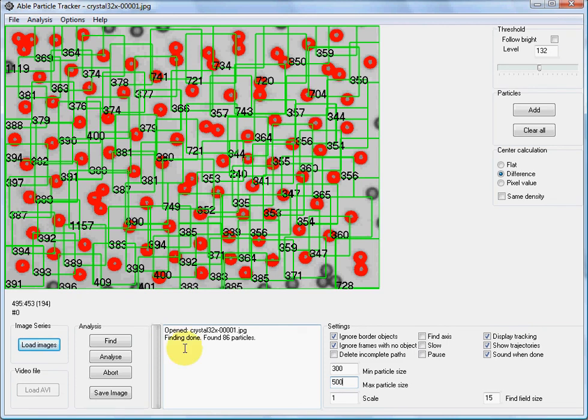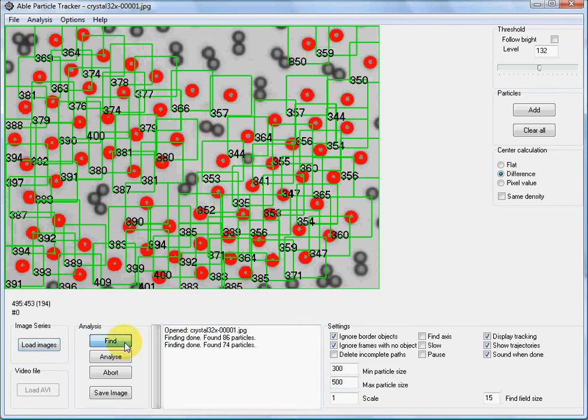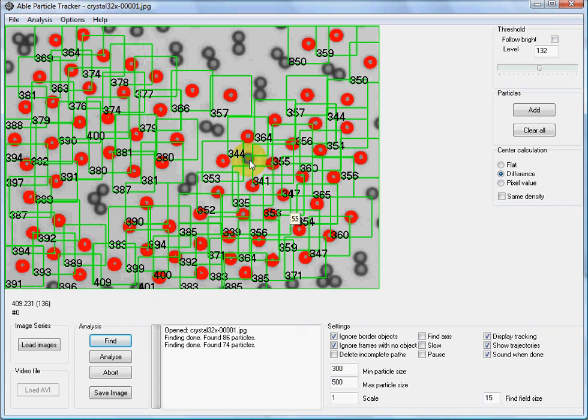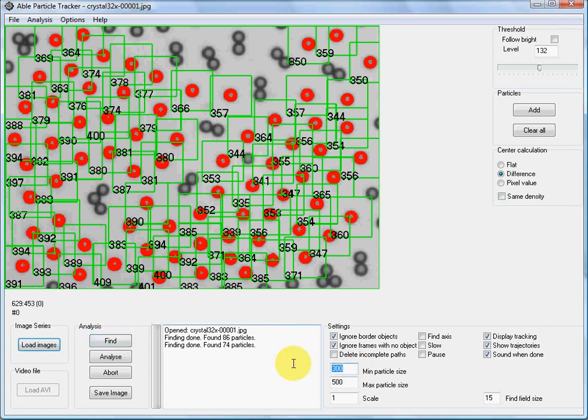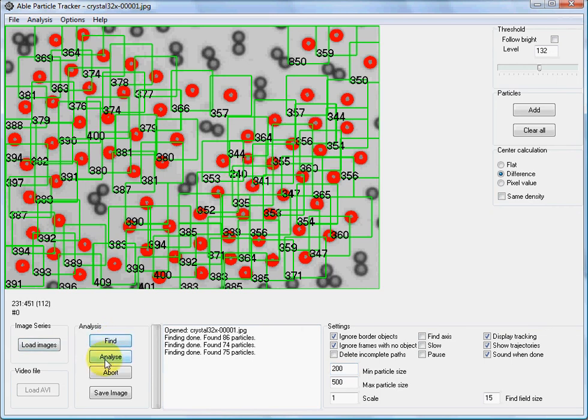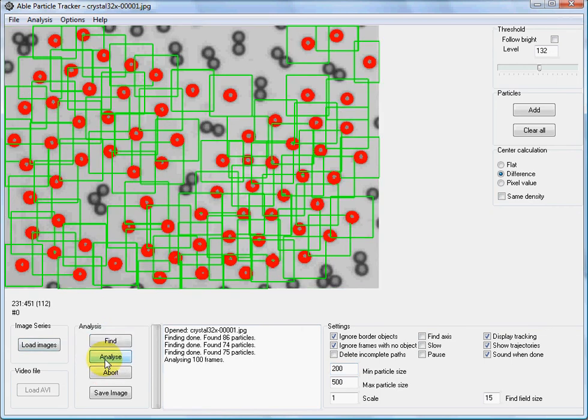Let's use the find button again. The program has marked only single particles. This particle is missing, so maybe enter a bit lower number, 200. Now this particle is included, and now we can start tracking.